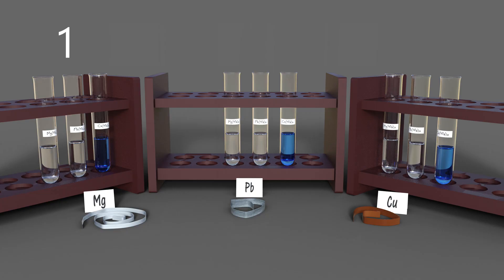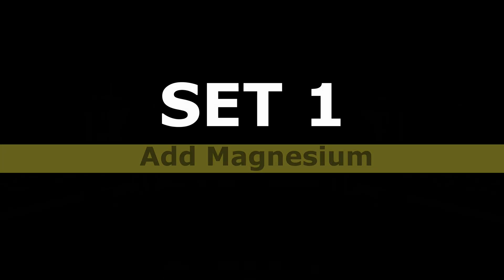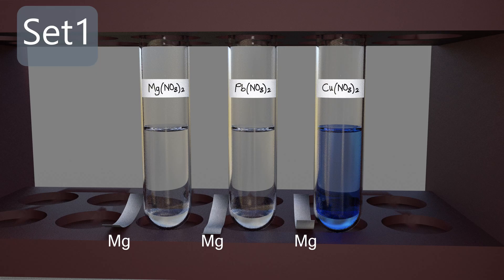Each set will be added with a magnesium ribbon, a lead strip, and a copper strip. Prepare three pieces of magnesium ribbons and add the magnesium ribbons into all three test tubes of set one, and observe.